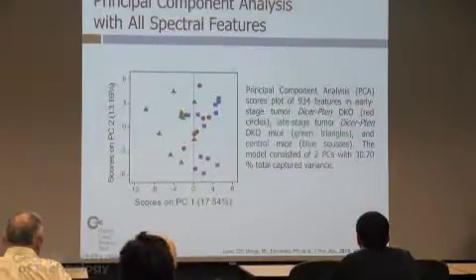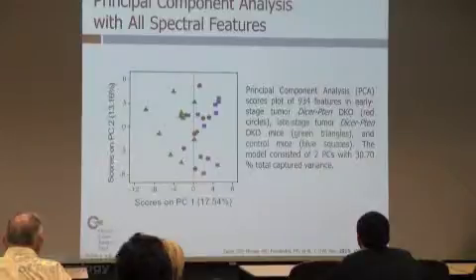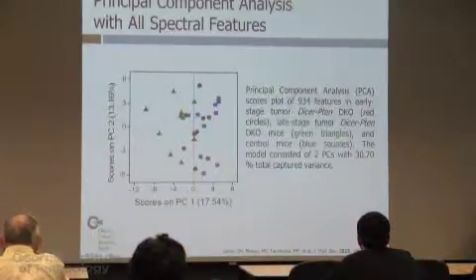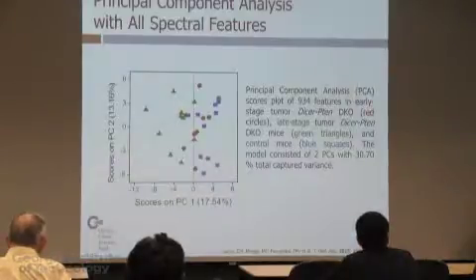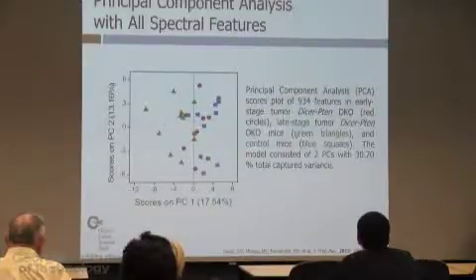If you take all the data that you get from the mass spectrometer and you do something relatively simple, such as principal component analysis, and this is the PC1 versus PC2, this is what you get. You see that the late stage mice separate relatively well from both the early stage and control, but the early stage and control don't separate. Is this surprising? No. I told you that early stage has no visible symptoms, so overall it's very hard to detect.